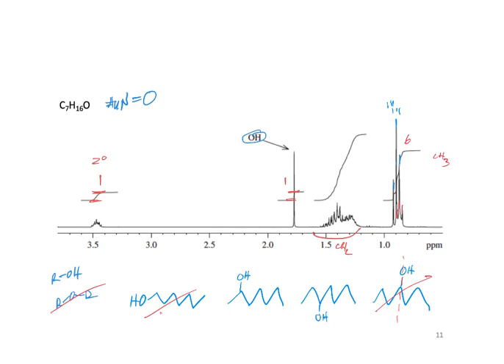So what do you think about this chemical shift? It's all the way down at like between 0.8 and 0.9. Does that fit for both of those? Yeah. I think that this one, being next to the alcohol, it would shift it further downfield. So this one would likely be more like 1.2 or something. So that would move it.